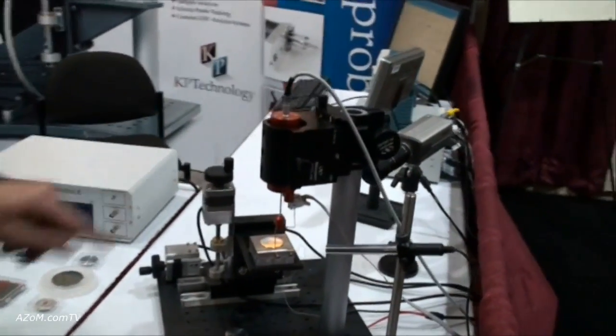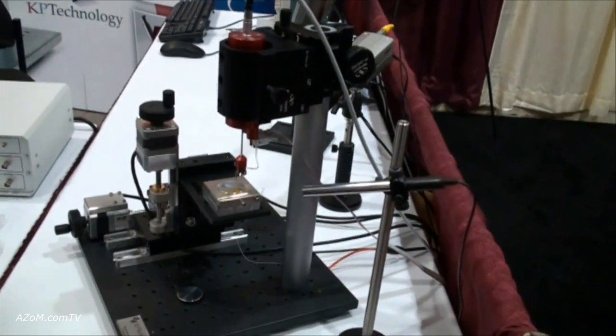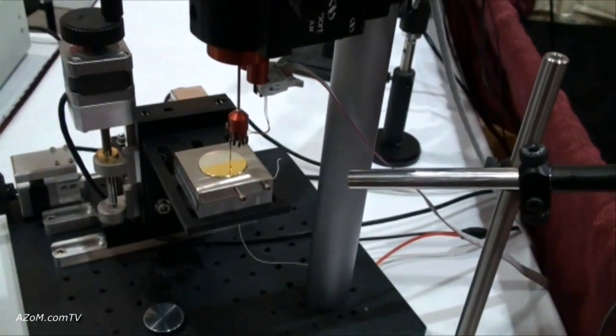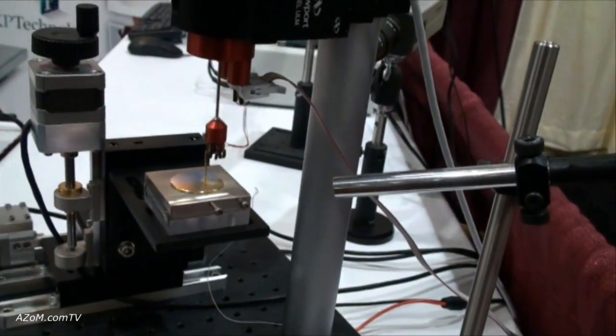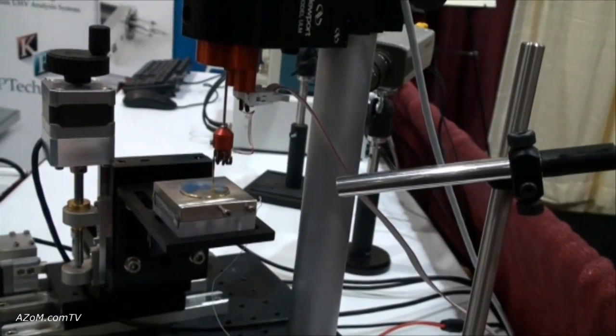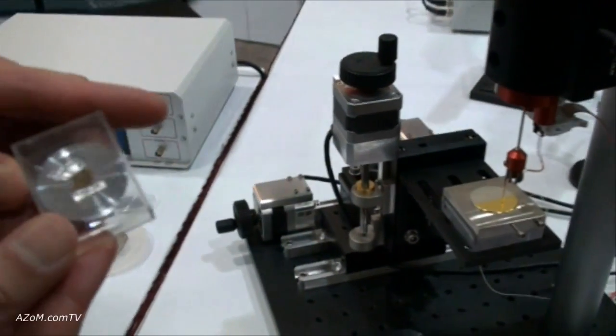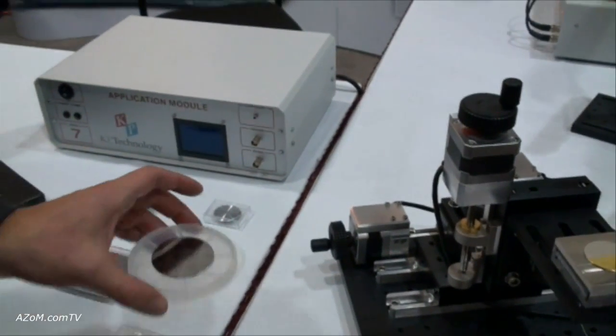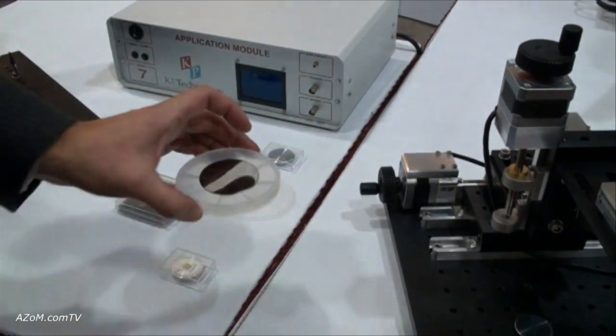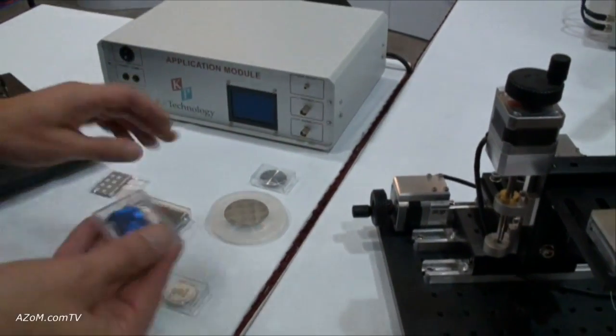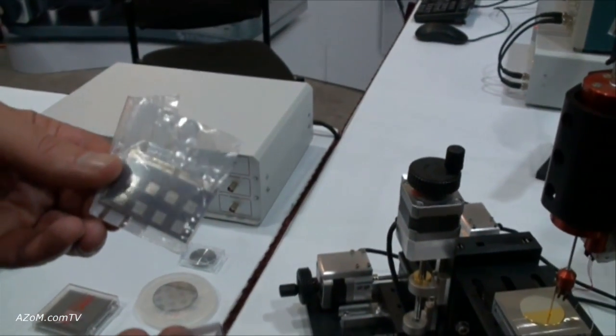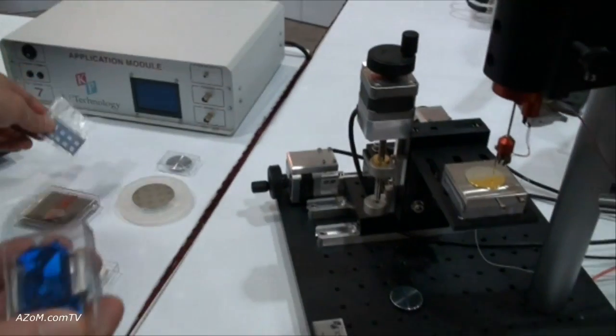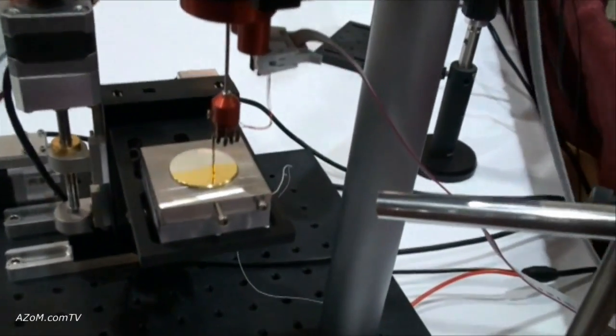The sample is aluminum and gold. The Kelvin probe measures the work function difference between a vibrating tip and the material under the tip. The material could be a metal, a device like this single electron transistor, a wafer with a pattern, or different types of solar cells. This technique is used for corrosion studies, polymer films, polymer electronics, and material studies.